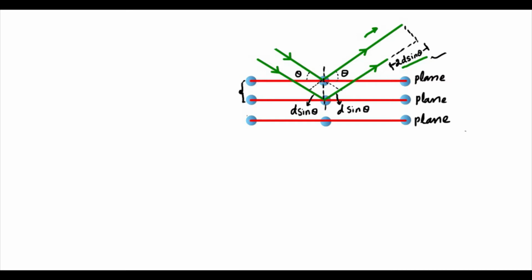For example, here we have the x-rays, which is the source in this case, and in our XRD device that was copper K alpha, and the wavelength was 1.5406, in angstrom.